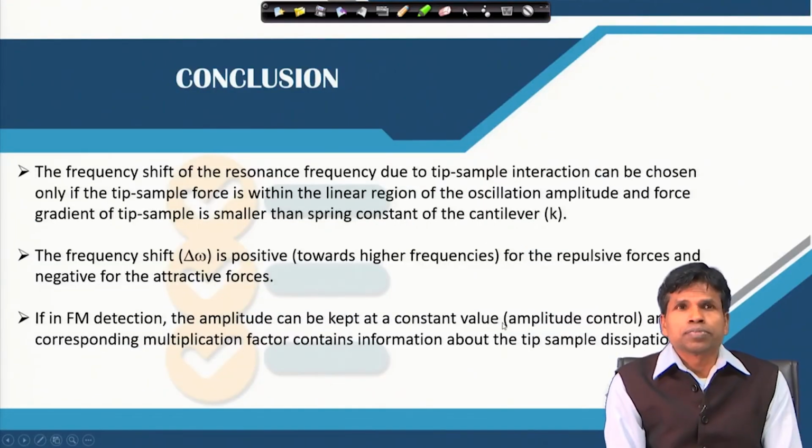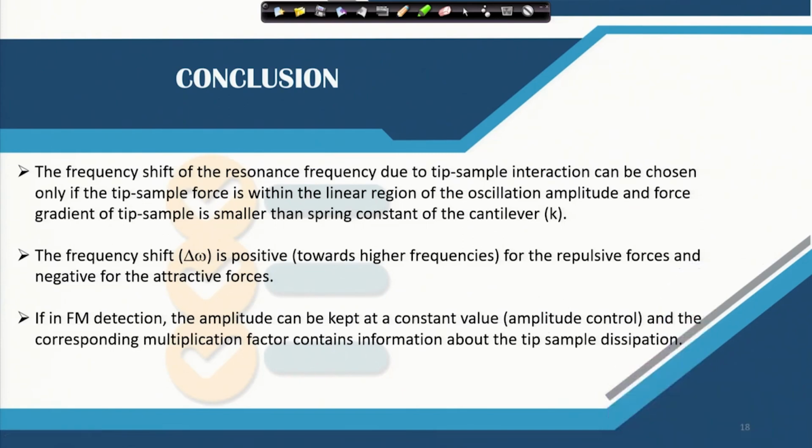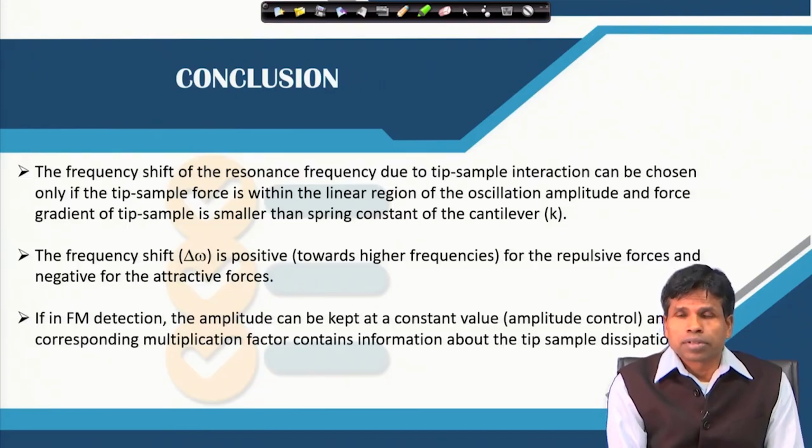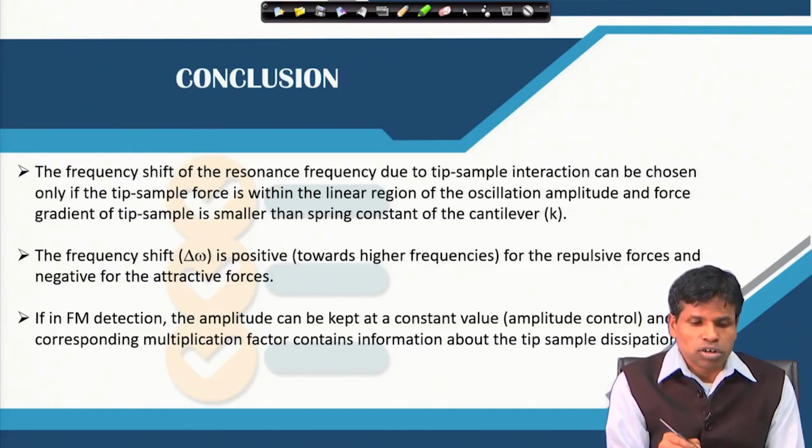So, in conclusion, the frequency shift of the resonance frequency due to the tip-sample interaction can be used in the non-contact mode if they follow the linear path, with a certain amplitude range, and that is in the attractive regime of the force-distance curve, which is used in the non-contact mode.